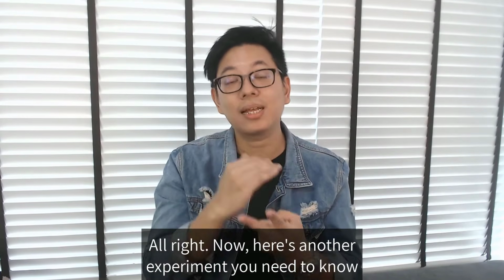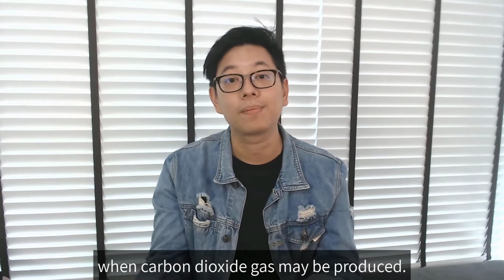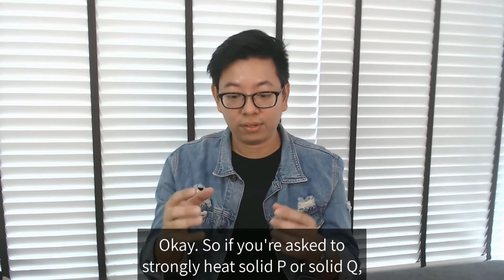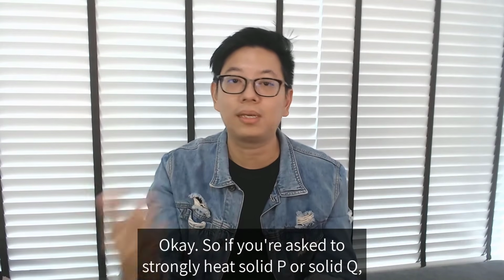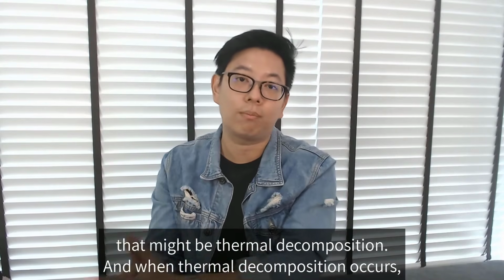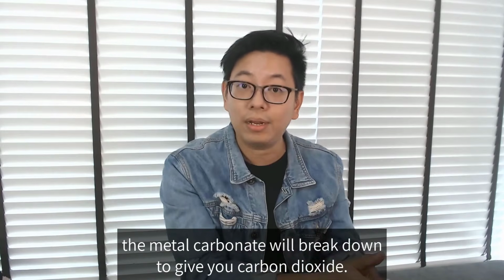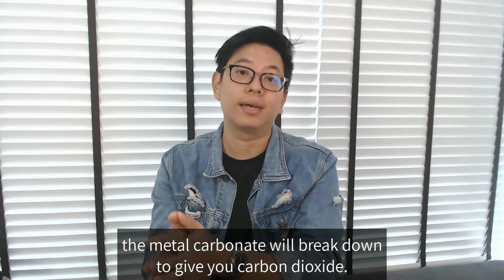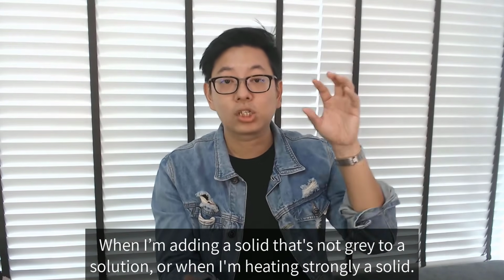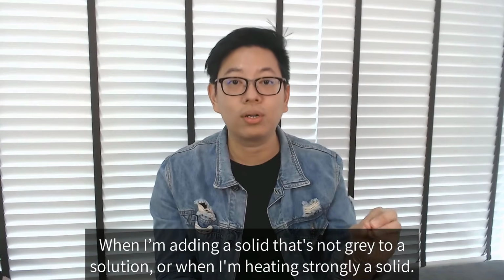Alright? Now here's another experiment you need to know when carbon dioxide gas may be produced. And that's when you strongly heat a solid. Okay? So if you're asked to strongly heat solid P or solid Q, alright, that might be thermal decomposition. And when thermal decomposition occurs, the metal carbonate will break down to give you carbon dioxide. Alright, so there are 2 instances where I would test for carbon dioxide: when I'm adding a solid that's not grey to a solution, or when I'm heating strongly a solid.